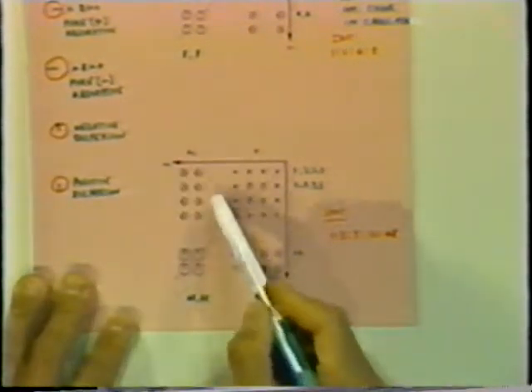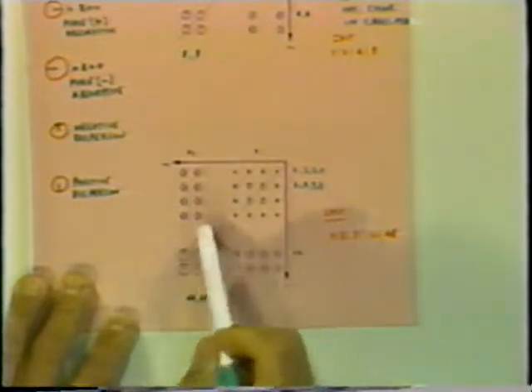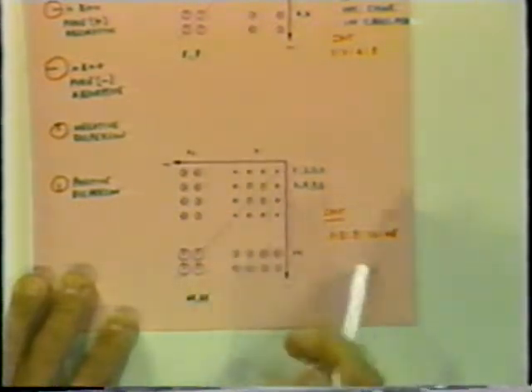Okay? For AX3 or A3X, the spectrum is more complicated and has somewhat similar behavior, except that if you look at the A multiplet, all the lines have equal intensity. Again, they are antiphase, and they cancel each other if they are overlapping, while not on the diagonals.